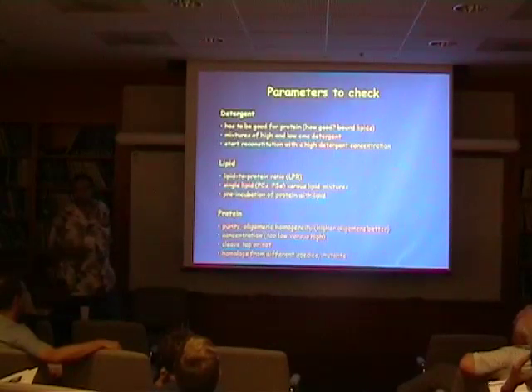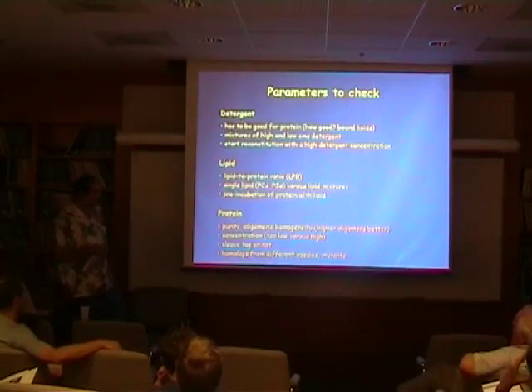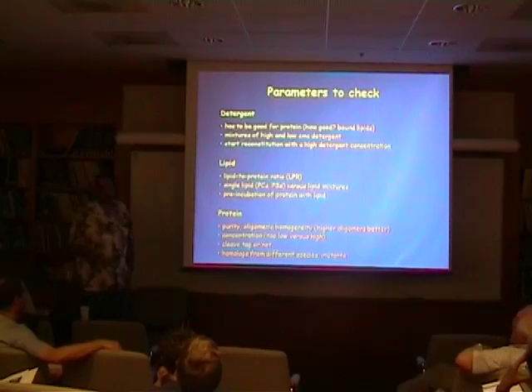Again, this can vary, other people don't believe that. I believe if you have a mixture between a monomer and a dimer, it's very hard to get a nice 2D crystal compared to if you start off with a pure dimer situation. But then again, once the protein is in the lipid, it can actually rearrange and form tetramers, and then it doesn't really matter what you start with. But this is really a point for discussion, whether this is important or not.